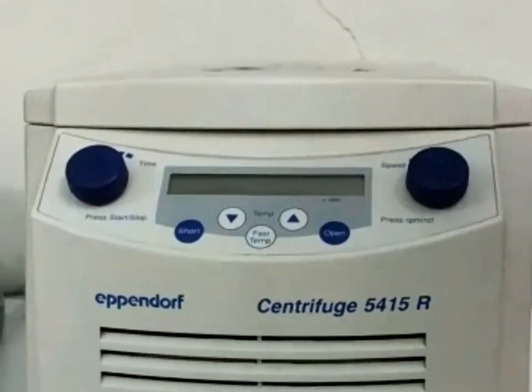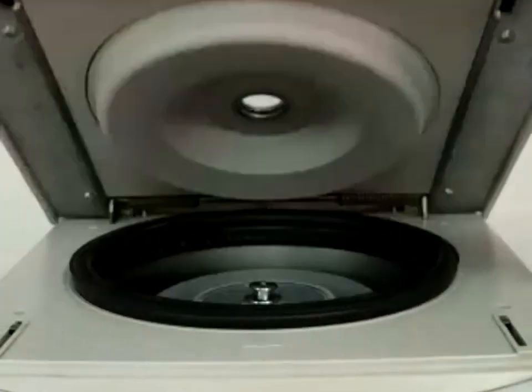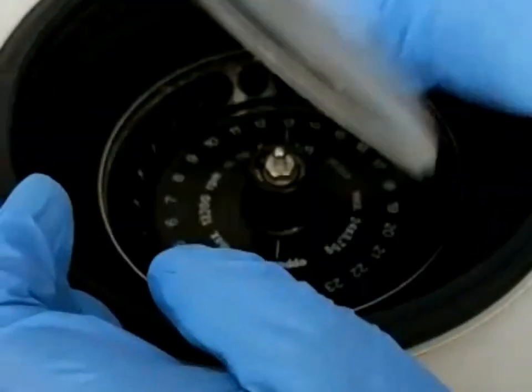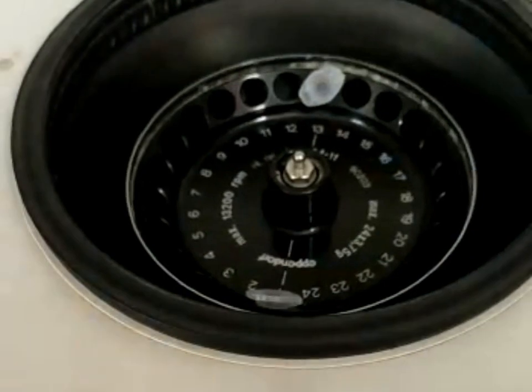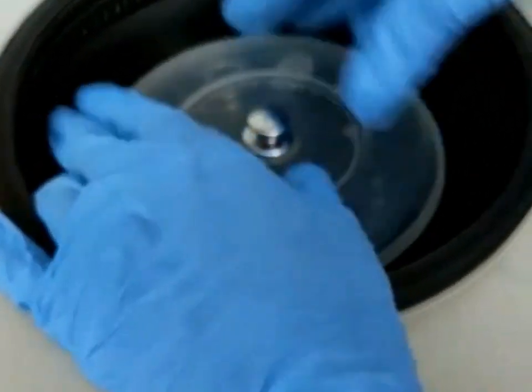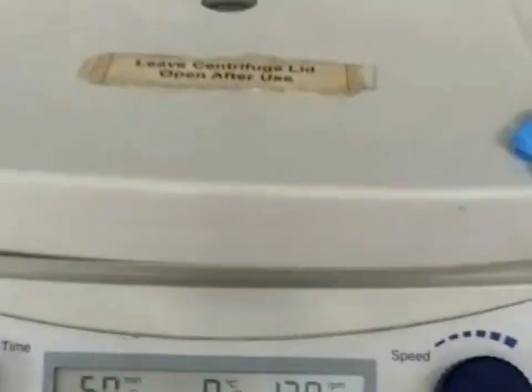To operate the centrifuge, first turn it on by switching on the main switch at the extreme side. Then press the open button to open the main lid. Remove the inner lid and load the samples, always making sure the samples are balanced properly. Then close the inner lid and also close the main lid.